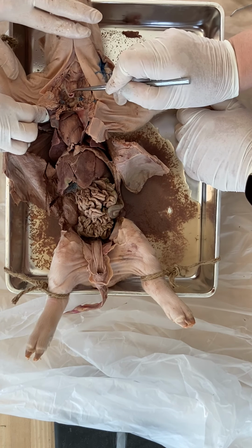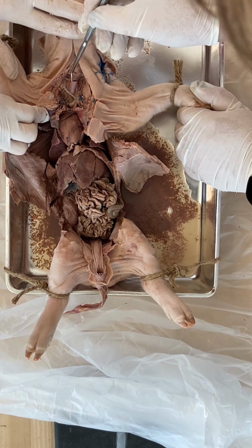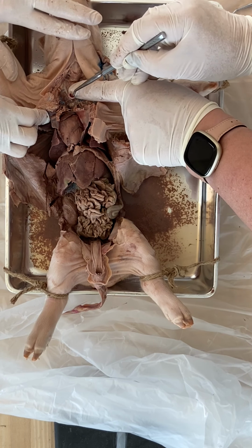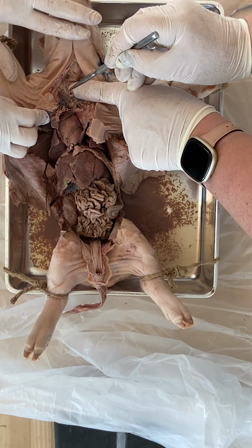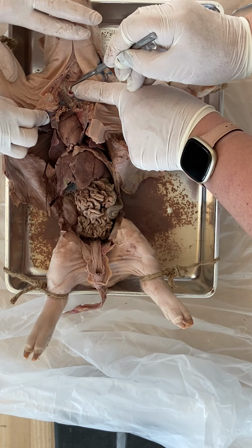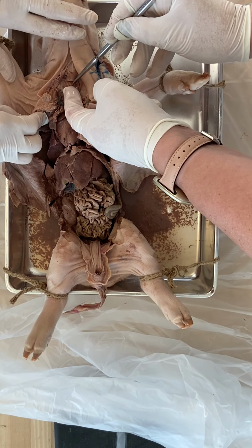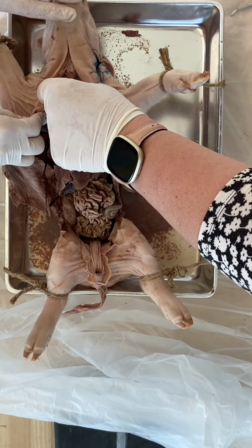And there we go. There is the trachea end on. Because if I went down here and then into the bronchus and into the bronchi, you can see that it is open. And those C-shaped rings, so here's the C with the back not complete because that goes against the esophagus. You can see just how open it is. So imagine that your trachea is just the same. And when you feel it, I can run my nail along those ridges quite nicely.